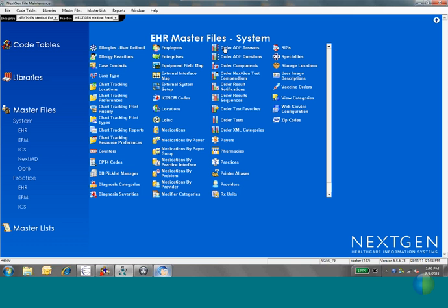It'll download AOE answers and AOE questions, and it'll link these to your tests, and it'll do your CPT codes. Oh, and it'll also do your order test favorites. So it took care of the majority of your file maintenance setup right there. And if you don't have the order management console, some of this stuff, like the order tests and the NextGen compendium, can be done through your interface analyst, but you'll have to link them together manually, and you'll have to do ask at order entry questions manually.